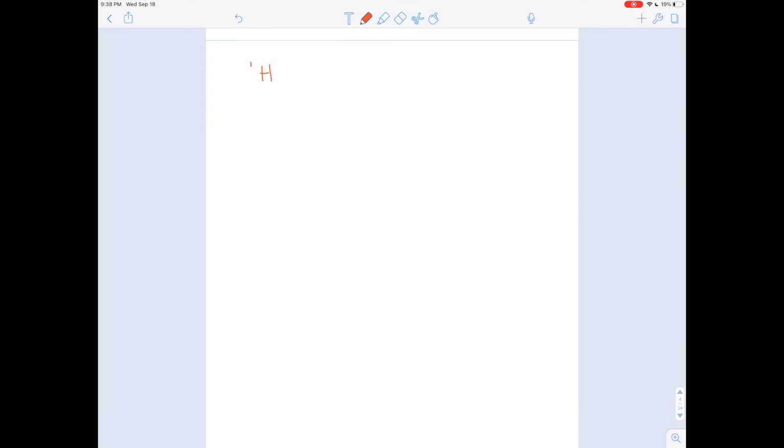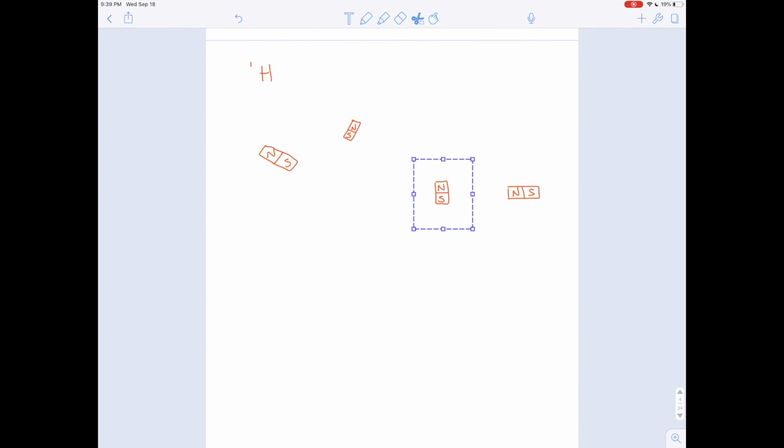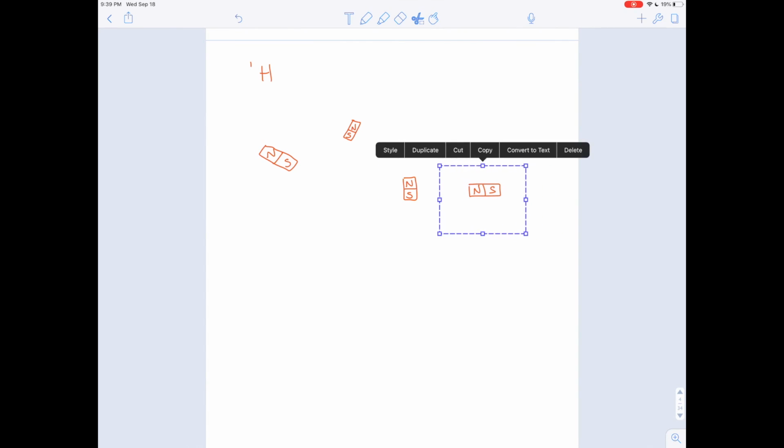Okay, so imagine you have a bunch of different hydrogen atoms, and each of those has its own little bar magnet nucleus. And normally, those would just be pointing in random directions. No reason they would all be in any way specific. Each one in its own place. As they are, they wouldn't absorb radio waves. Shine it through, and the radio waves do nothing to these.